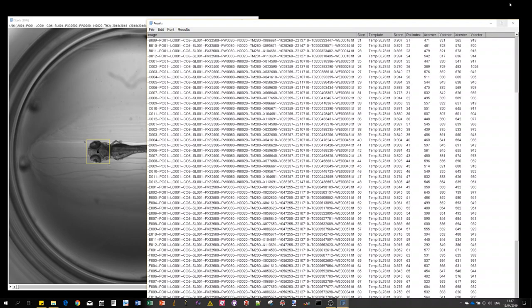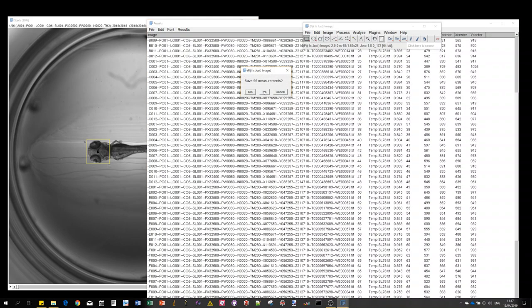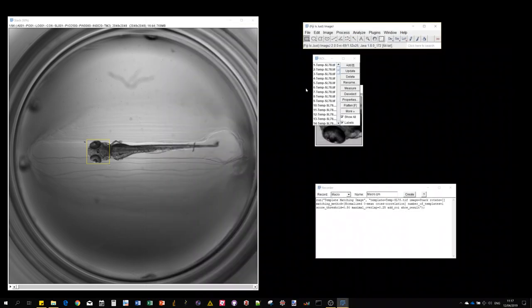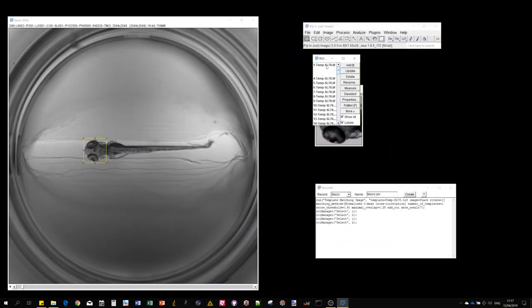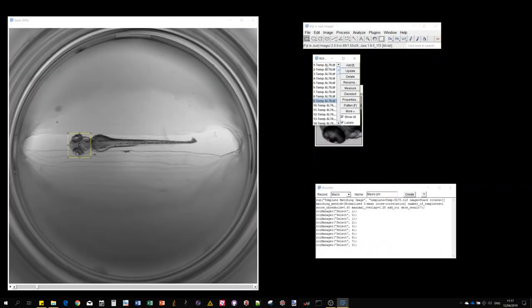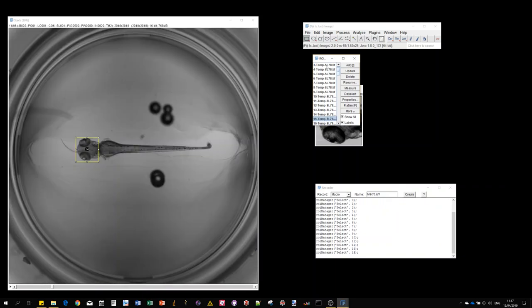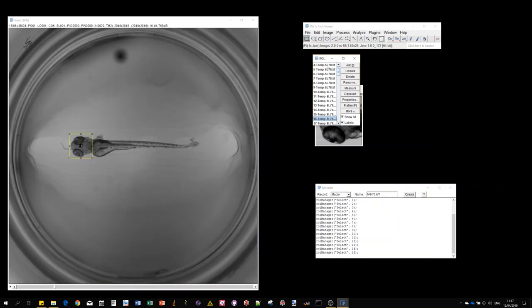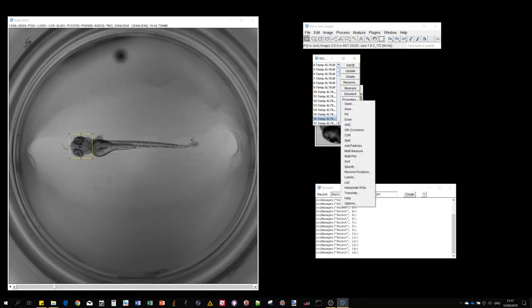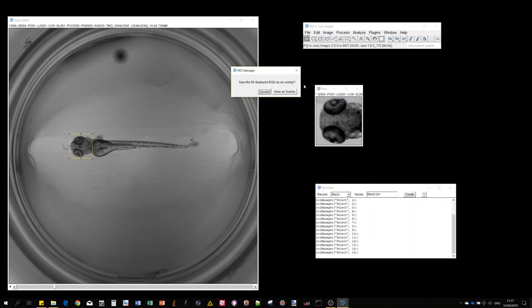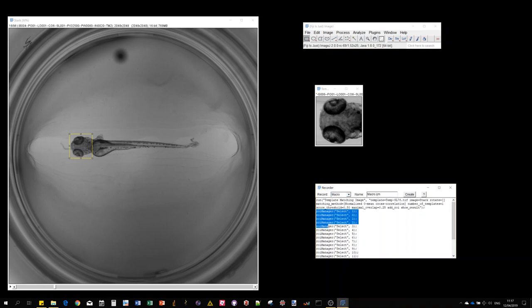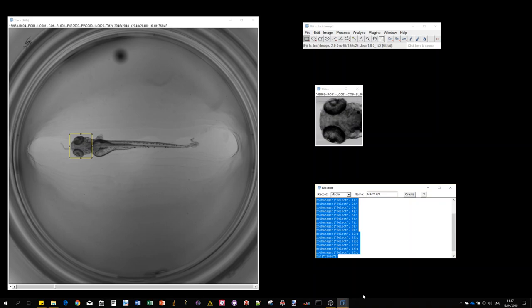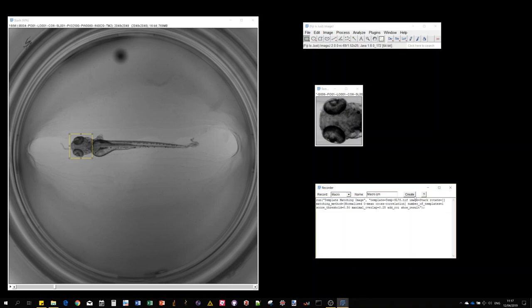You can use the ROI manager to browse through the detected regions of interest. You can save them, do some measurements, just like any regular region of interest.